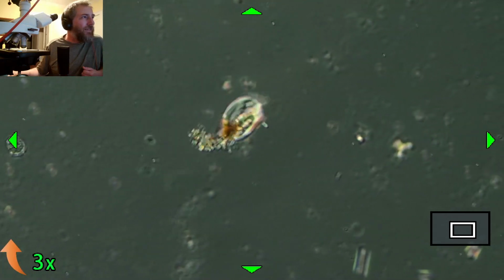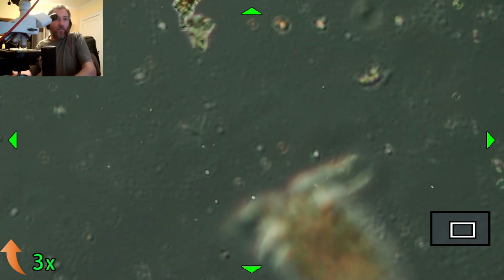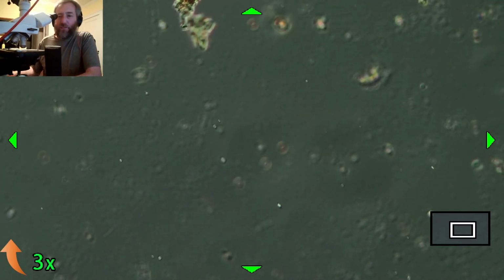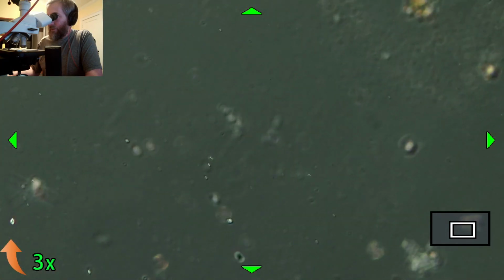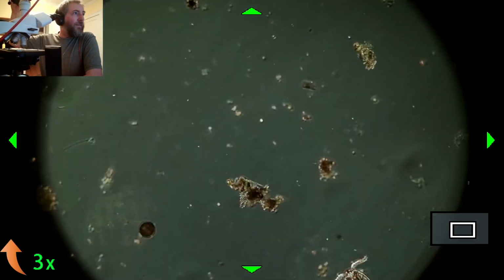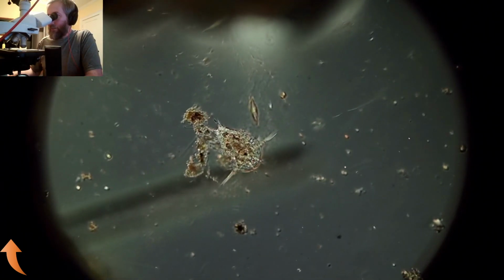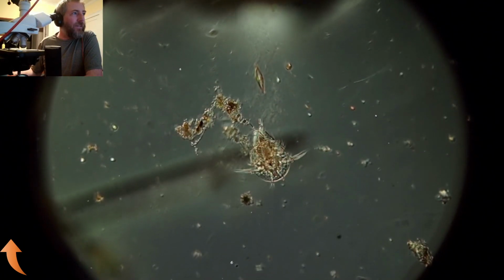A little ciliate. It's sort of fish-shaped. Same way as the other one. It's kind of got an asymmetric body plan. There's a bunch of stuff kind of stuck in there, all over the place. You can find something. Oh, there's a big nauplius. That one's getting close. That's probably right one stage before they become an actual copepod. It's really full size. And if a copepod swims by, you'll see it's almost the same size as a copepod. So that guy's a big one.